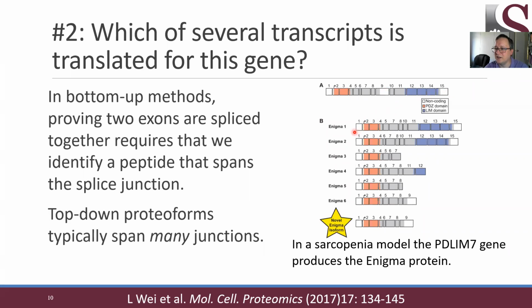So we see that the longest isoform that we can produce from it contains all but, let me see, here we're missing the 6th exon and we're missing the 9th exon, but I think all of the others are present. That's the longest isoform. In some cases, we see that exon 6 is included, but not exon 5. You see that?